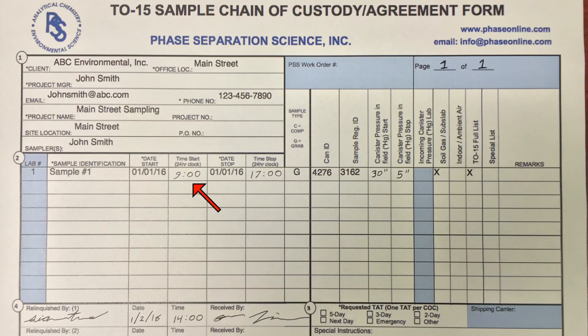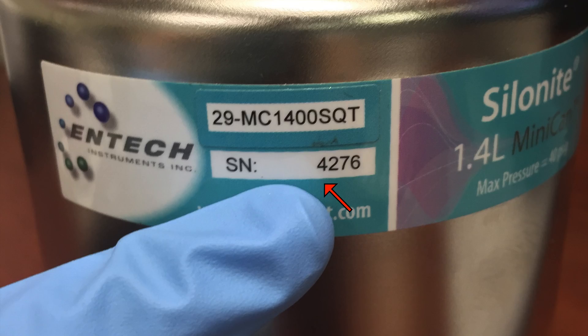Double check your provided chain of custody. The times should be recorded according to a 24-hour clock, and the identification numbers on the can and flow controller must match each sample. The IDs can be found on the can and flow controller as shown.